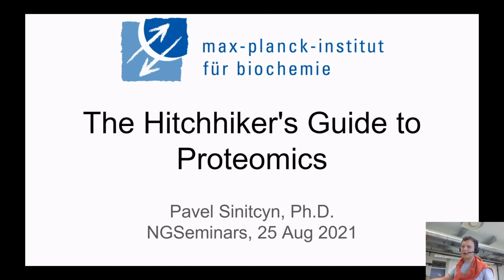Later we will discuss how we can apply this method in general, and maybe we can make a second part if people are interested. We're going to discuss the application of MaxDIA. There's a special type of proteomics called data-independent acquisition, but it's a very complicated topic even for people in the field. That's why I think it's very important to make a good introduction initially. Okay, let's go. Hitchhiking guide for proteomics.